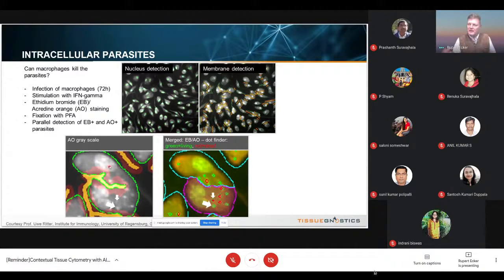So, if we have here a lack of contrast between these two cells, as we can see here, the primary segmentation algorithm did not succeed in segmenting two objects, but identified one doublet, a double cell. With a special detail algorithm, we close such gaps, and in the end are able to segment two separate cells and then count inside each cell how many parasites there are.